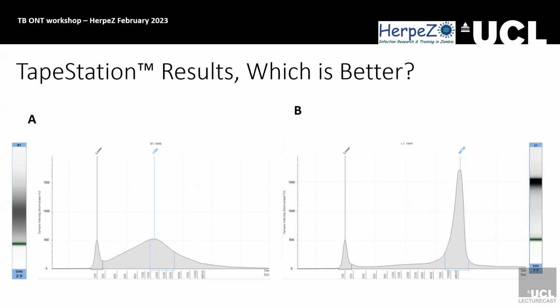Can you just show, do you have an example? Yeah. So down at the bottom, those blue squares, right there where it says 7.7. Yeah, it does. It gives me some form of score, but typically I would still look at the curve itself. The better your curve, the higher the score in theory.